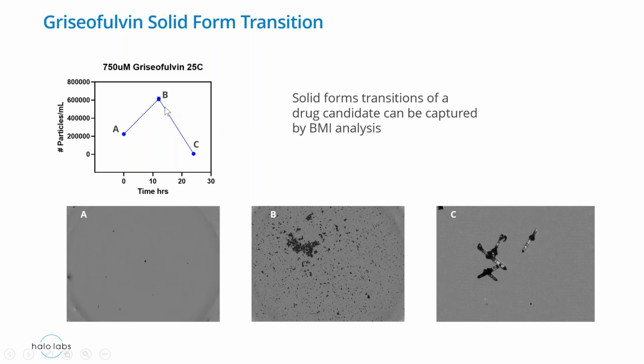But if you just leave it long enough, a whole day, then something very interesting happens. You see a drop in the number of particles, and then you also start seeing these crystal forms appearing. And this is very useful because this is already telling you that this drug will go through a solid form transition into crystal. And this is something that is usually overlooked.